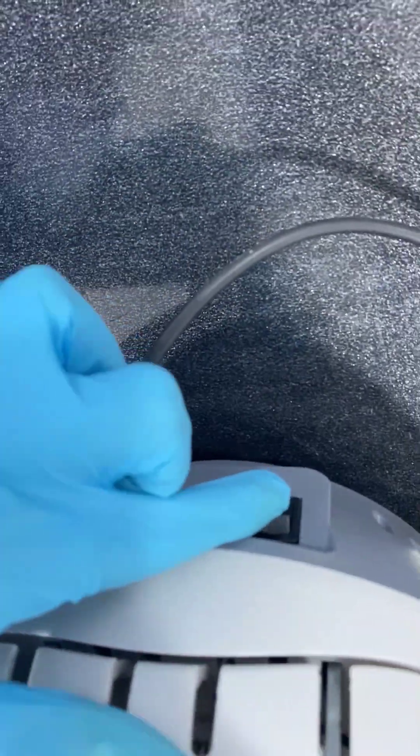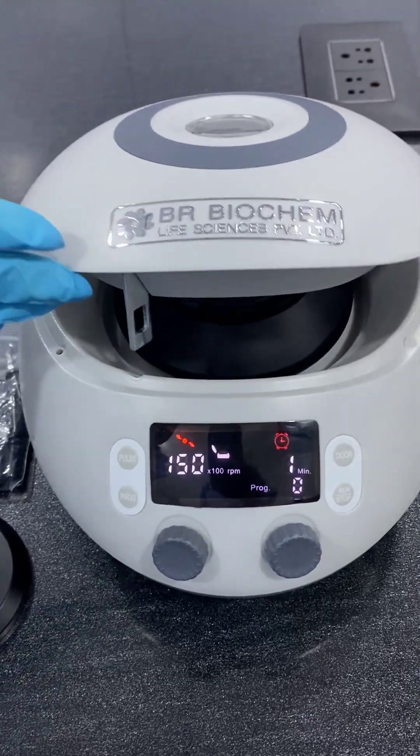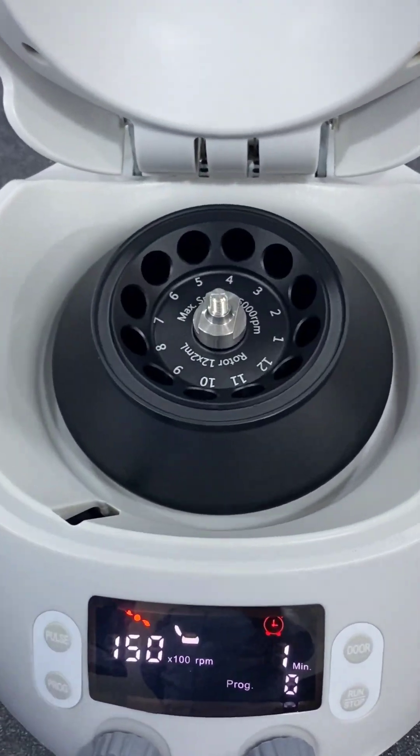To start the machine, press this key at the back of the machine. In the rotor, you can insert the desired tubes.